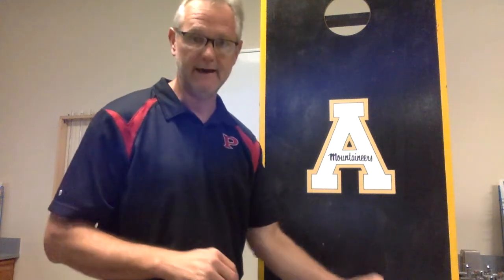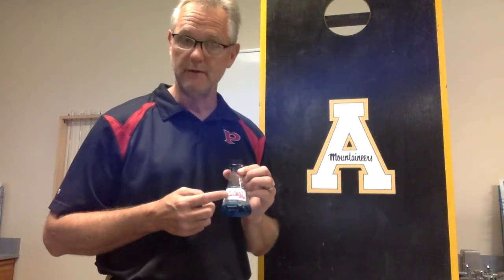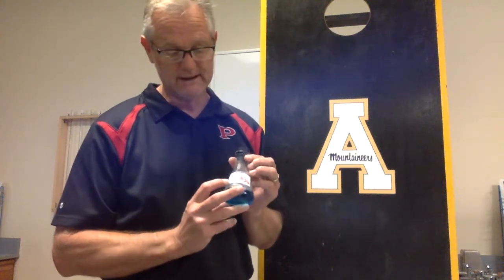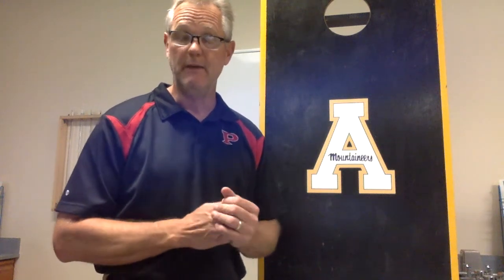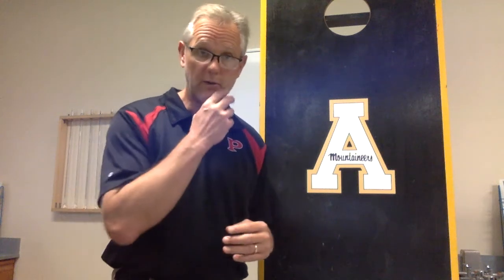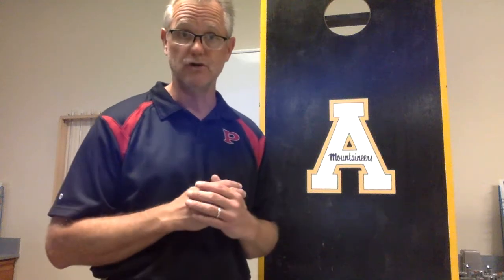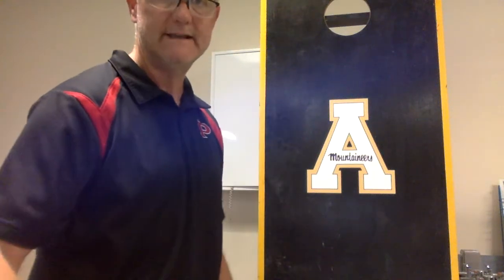So I have a series of metal samples that we're going to go through and see what type of light is released based upon the metal. You can see this first one is a copper solution. So we want to see what is going to happen based on the electrons moving in the copper. What I would like for y'all to do is to open up your virtual or digital notebooks to page 31. And we have the samples.